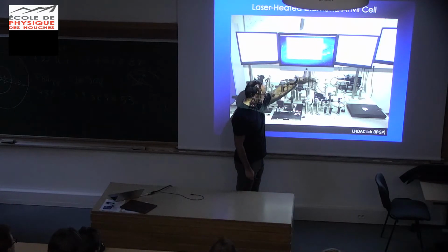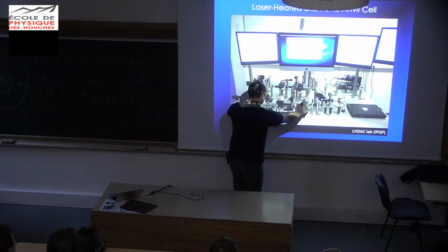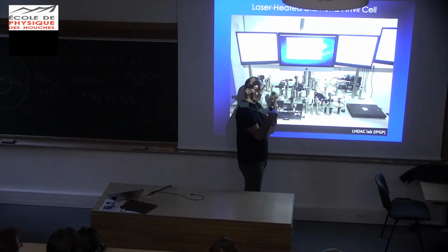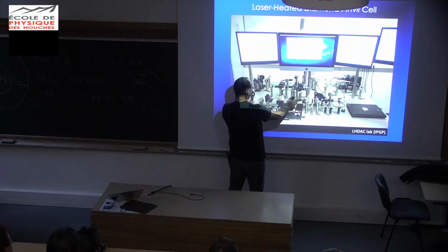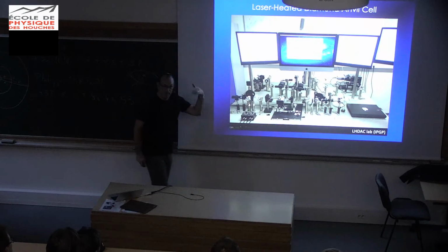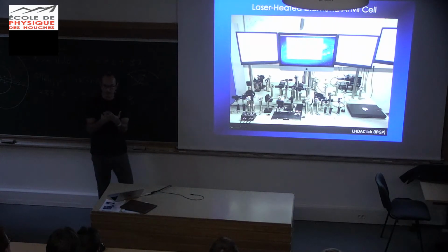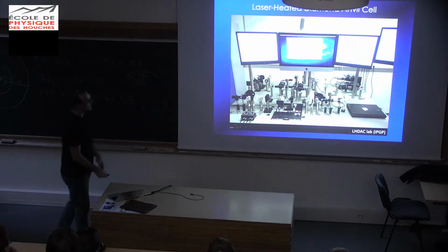It's an infrared laser, a high power 200 watt laser that comes in, is split in two, goes this way, that way, through two lenses, focused on the sample in the same spot from the two sides at the same time, okay? So the infrared goes this way, the visible goes out. These are special mirrors that reflect infrared and let visible go through, and the visible will go through all the system to the spectrometer, and this is how you measure temperature by spectroradiometry, by looking at the color of the light that's coming out. Exactly in the same way that you measure the temperature of a star, okay? And this is a record of temperature here.